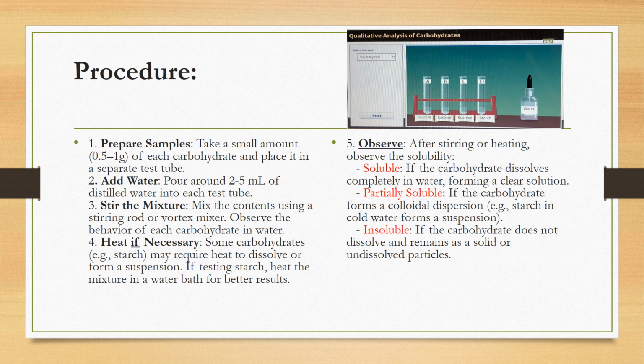The starch. Some carbohydrates like starch may require heat to dissolve or form a suspension. If you are going to test the starch, heat the mixture in a water bath for better results. That means starch does not dissolve in cold water, but it needs heating to dissolve.